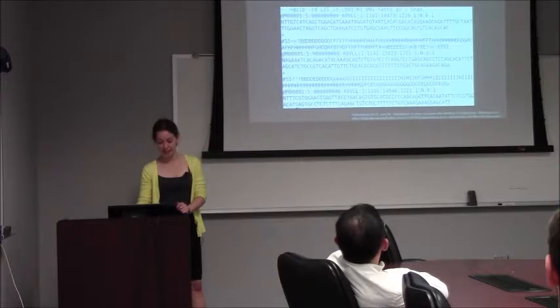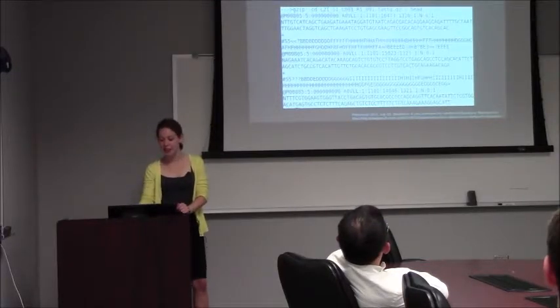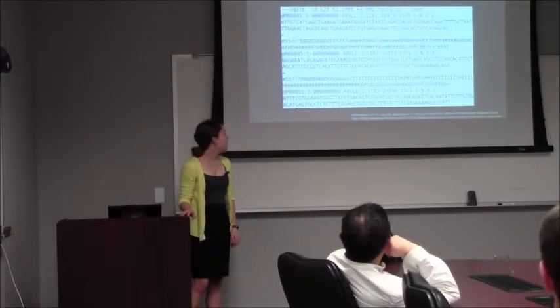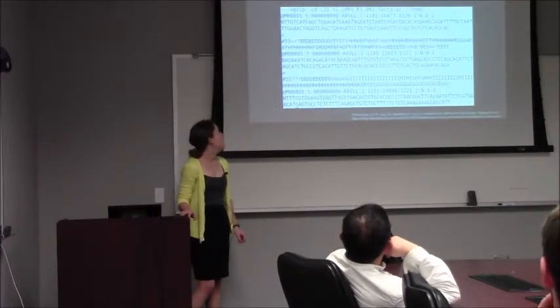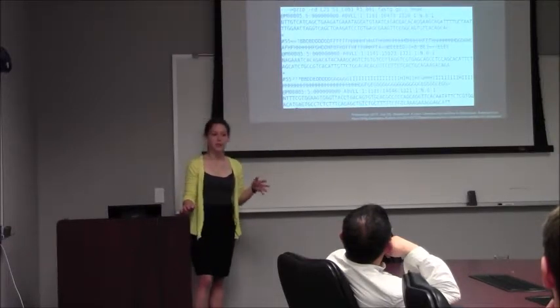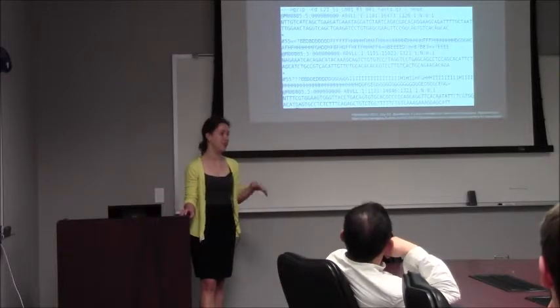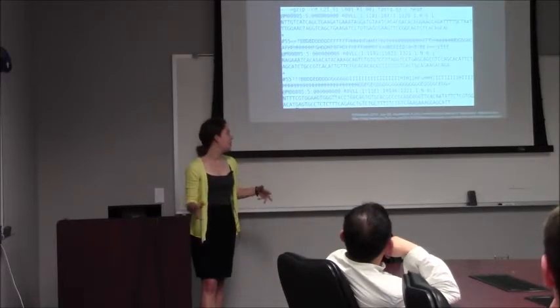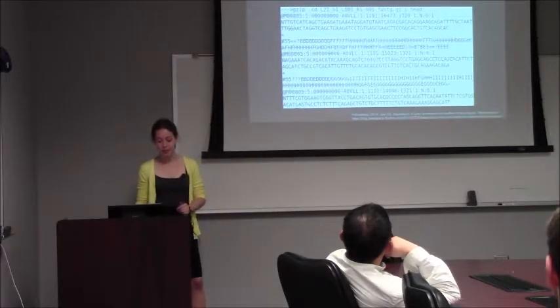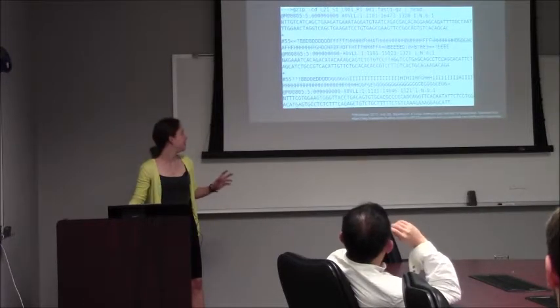And if you were to look at the output of a sequencing machine like this, you'd get something that looks like this. Which, there are numbers, but it's probably not what you wanted. And it's not just the 3 entries, you'd get like 30 to 50 million of these entries per sample. So your data set could be very large. So to understand what this is, I'm first going to talk about what the sequencing machine is doing.